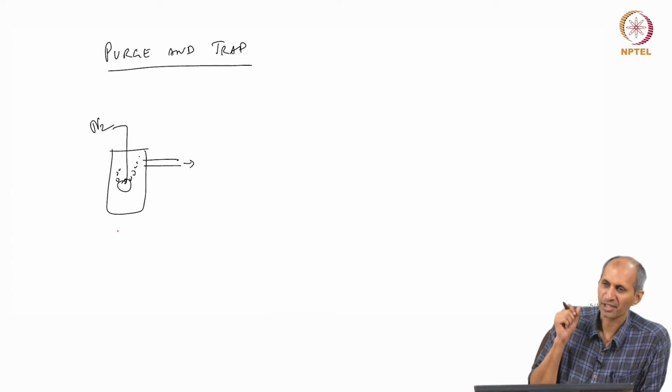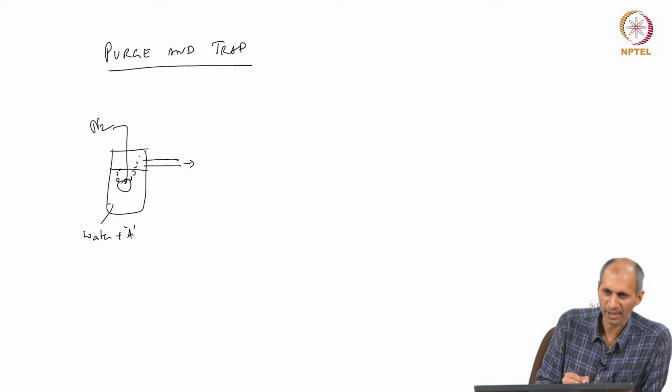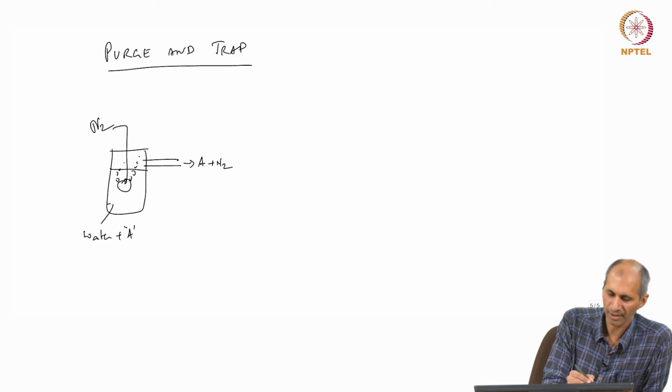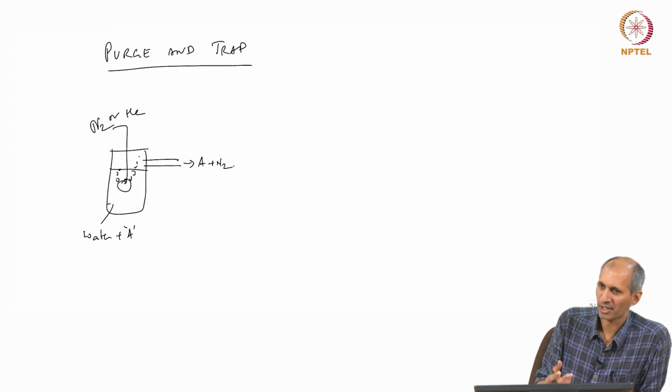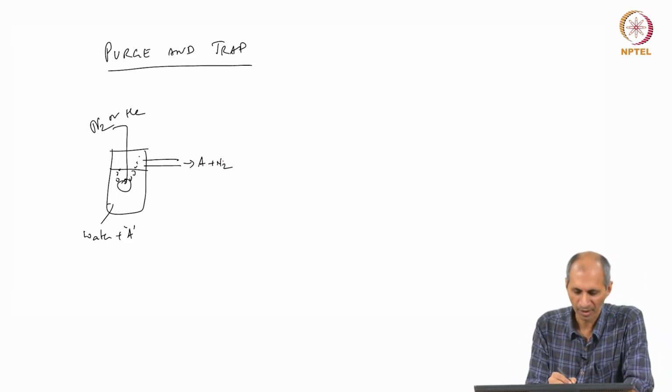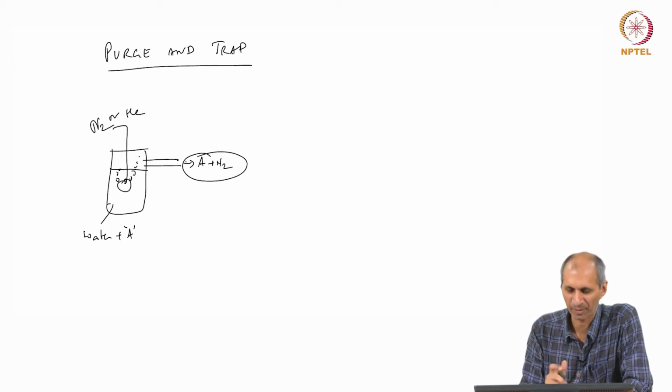When nitrogen gas is flushing out all the volatiles in the system, you are stripping the water. This is the water sample. This is water plus analyte, analyte plus nitrogen, both of them are coming out. Again nitrogen, or helium or argon, whatever you are using. This comes out, you are basically extracting, but you are not extracting using solvent, you are extracting using the gas, vapor phase, because that is favorable. This is a volatile component anyway, it is coming out. Now at this point this becomes like a vapor sample, an air sample.